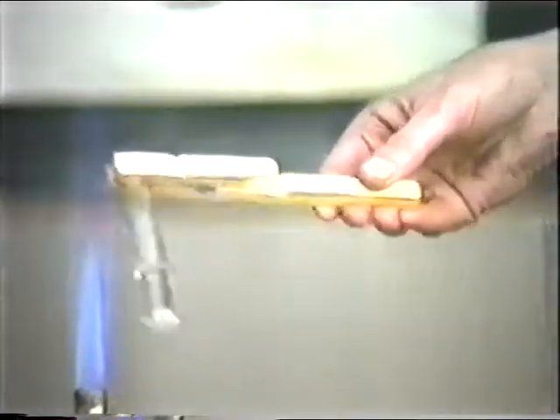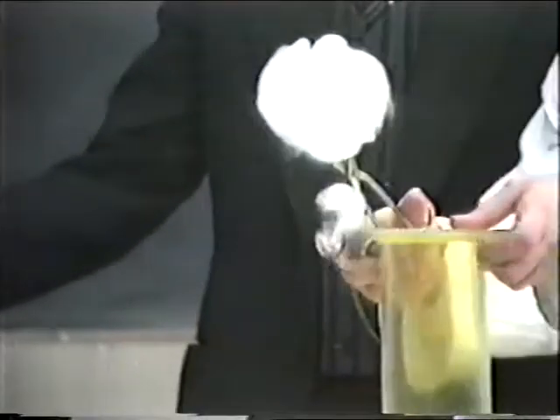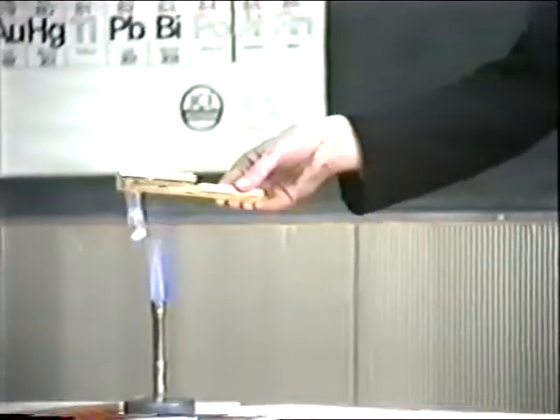And are we ready now, Bernie? We're now nearly ready to go. Bernie's just going to, right, no, not yet. Now what's going to happen? I'm going to get this boiling. You're going to put the glass wool in, push it down, and I shall then pour some hot turpentine on, and we shall see what will happen.